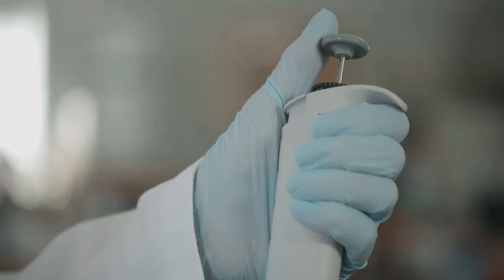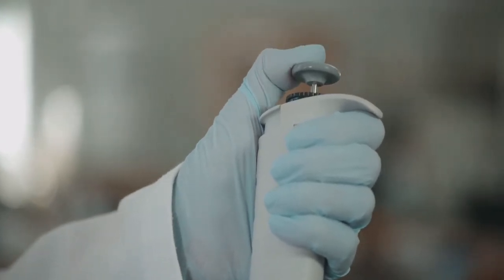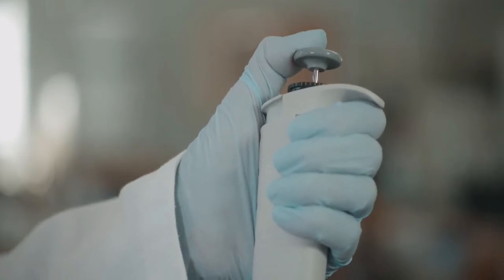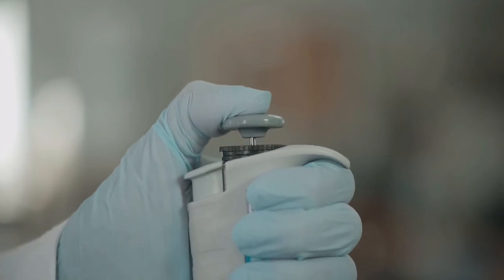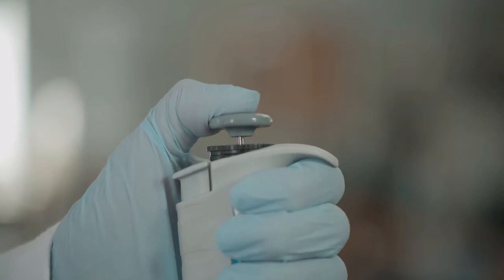Fluid is taken up into and expelled from the pipette tip by using the micropipette plunger. The pipette plunger is operated by pushing down on the button on the top of the plunger. The plunger has two stops. To aspirate fluid up into the pipette tip, push the button down to the first stop.